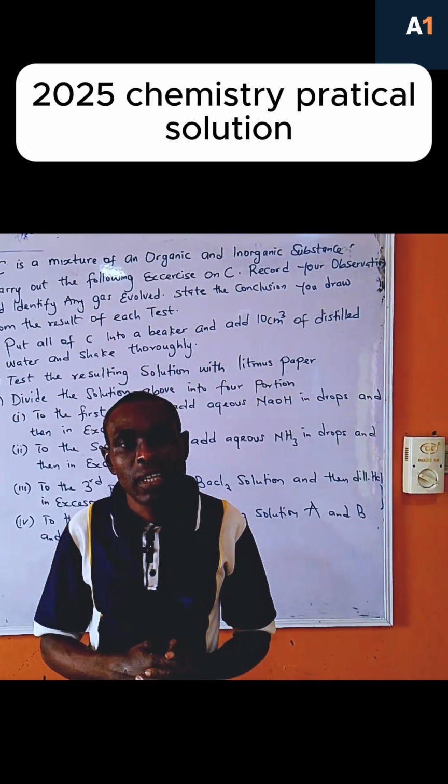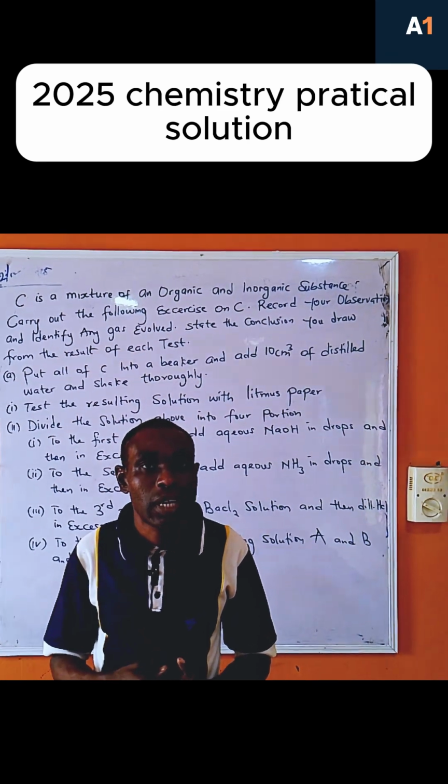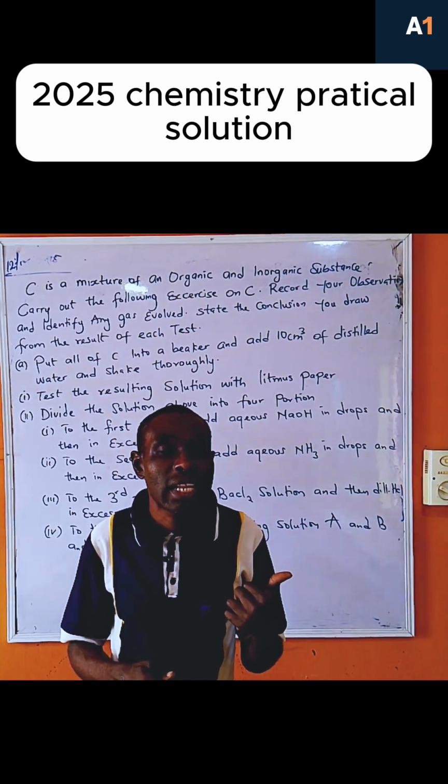Okay, welcome back. So we just concluded part A of that particular chemistry practical, but this is the second part, which is called salt analysis.